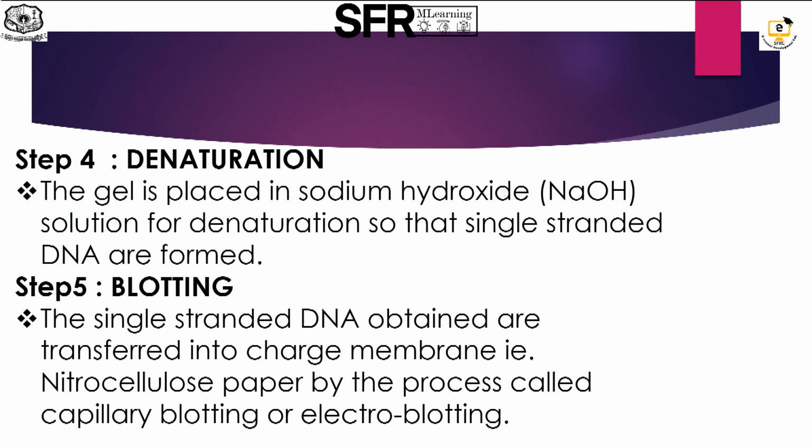The fifth step is blotting. The single-stranded DNA obtained from the denaturation procedure is transferred onto a charged membrane, that is, nitrocellulose paper, by the process called capillary blotting or electroblotting.